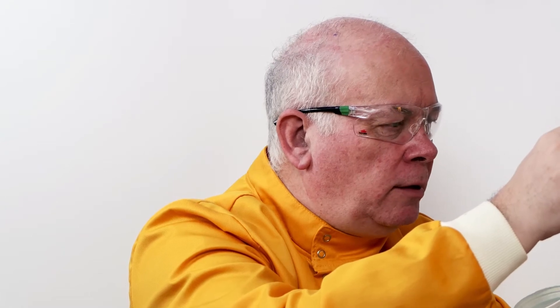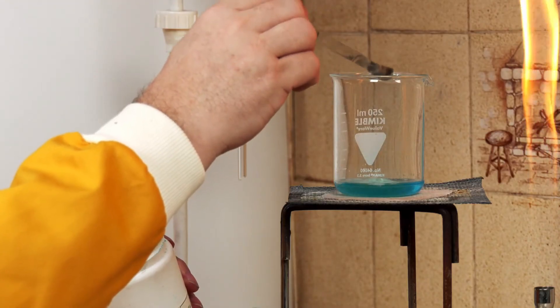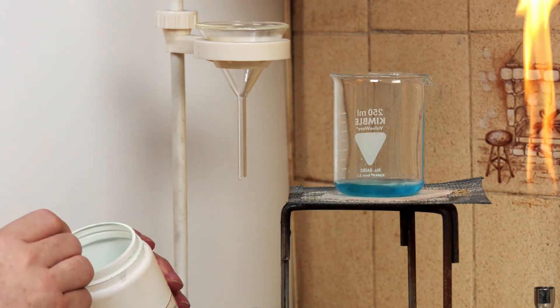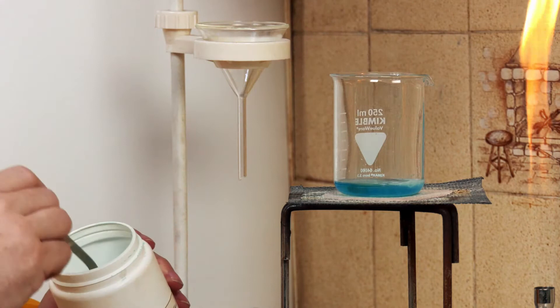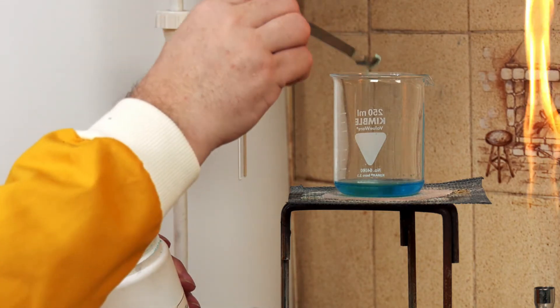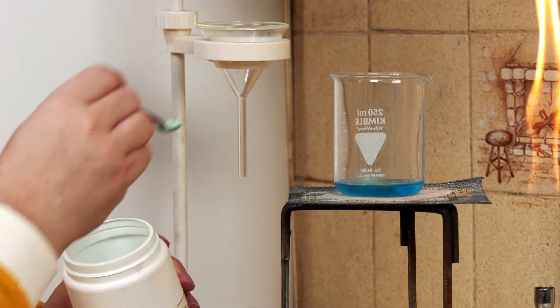In a different experiment we've looked at making this using copper oxide but in this case it's easier to see the reaction working because the carbonate reacts making this carbon dioxide as well as we can see the dark blue appearing.